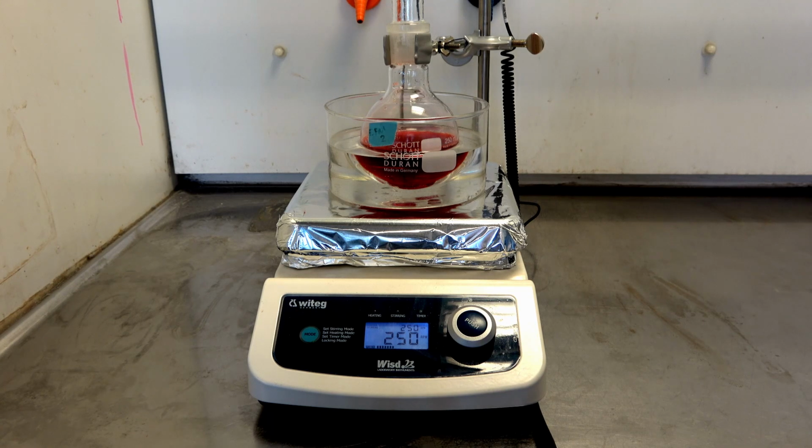On some stirrers, the RPM and the temperature can be controlled with knobs, while on others, the settings are displayed on an LED screen. On this WITTEG stirrer, the heating can be turned on by pressing Mode and choosing the desired temperature by turning and then pressing the knob.